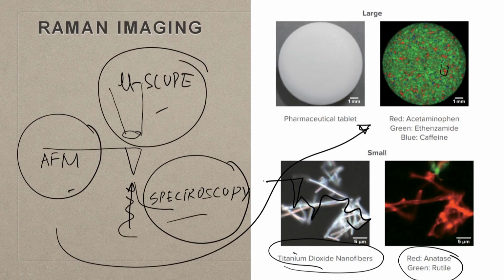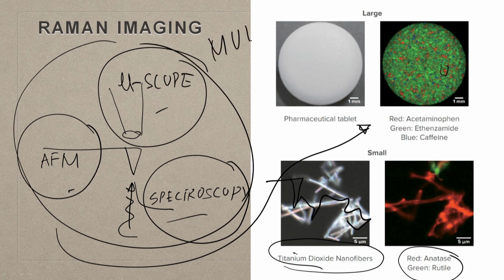Then we talked about coupling Raman using a multimodal platform for coupling Raman with imaging, where Raman, AFM and microscopic techniques could be used together.